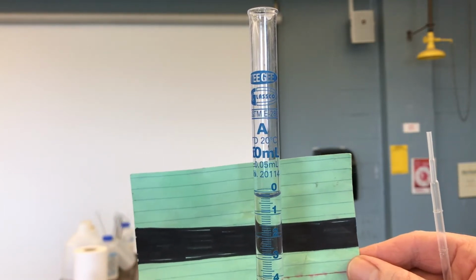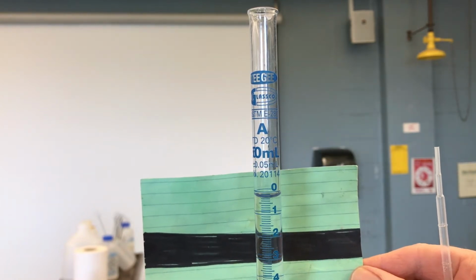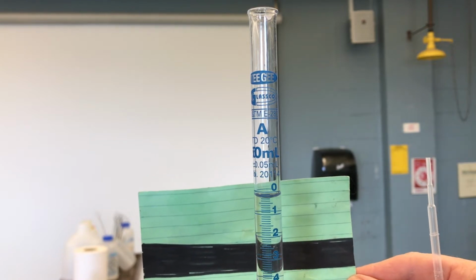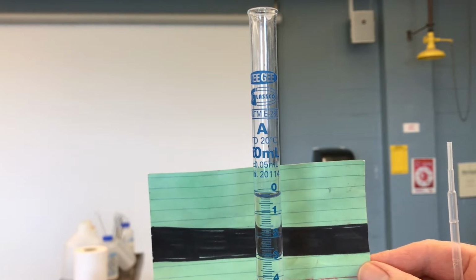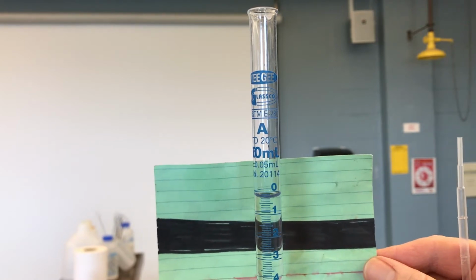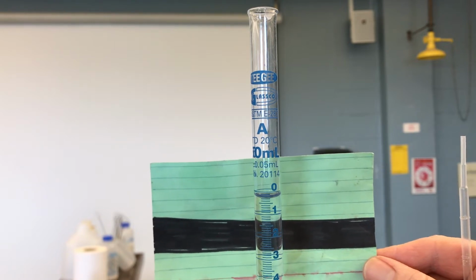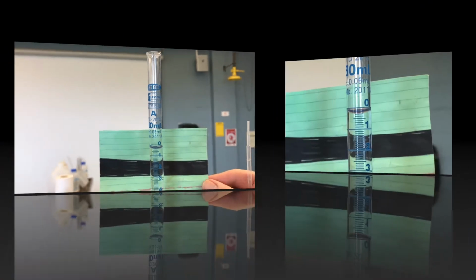And remember with the burette, you always read to 2 decimal places, and it's also read going down. So we don't care how much volume is in the burette. This burette right now contains, I don't know, somewhere around 50 mLs. That doesn't matter. We just want to know what the initial volume reading is. So we're around the 0.2 line, so we'll read it as approximately 0.2 mLs. And when we look at the photo, we'll talk about reading it exactly.